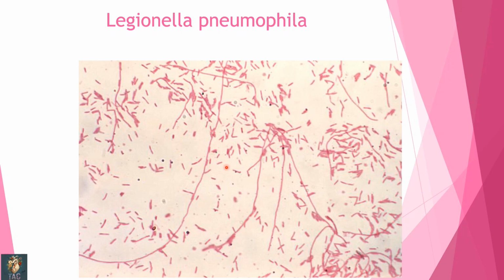Legionella pneumophila. On this slide, you can judge it is a gram-negative rod, as it is having rod-like structure and the stain is gram-negative stain. So the diagnosis is Legionella pneumophila.